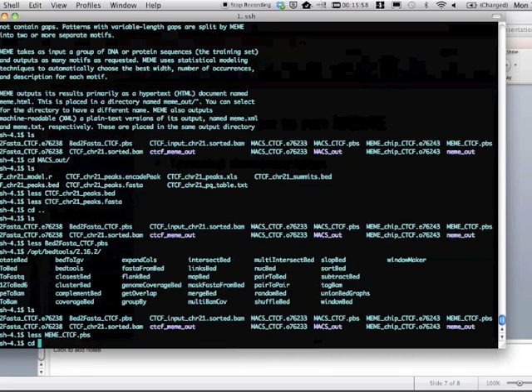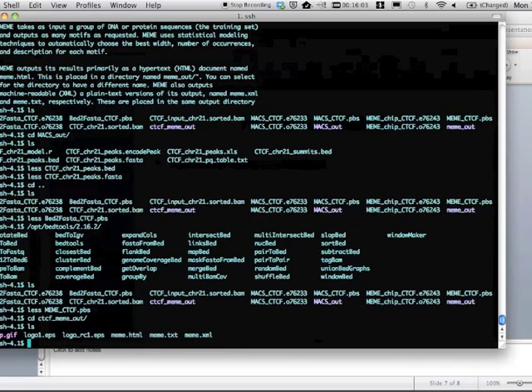So now let's go to that output directory. What MEME outputs is basically 3 file types. Your logos. Here it only found 1 logo. It automatically decided how many it was going to find, and it decided it was only going to find 1. It gives you an HTML file and then a text file, which basically lists the information of the logos and the HTML file, but in a much longer format.